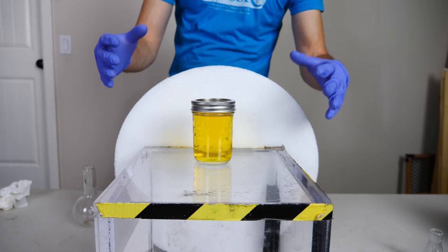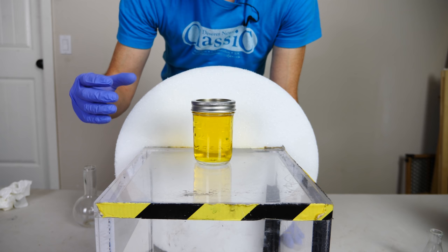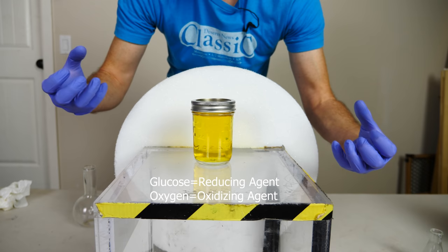Okay everyone, today I'm going to be showing you a chemical stoplight experiment. Now in this experiment, we're going to be seeing a battle between oxygen and glucose. Oxygen will turn it green, glucose will turn it yellow, with an intermediate being red.